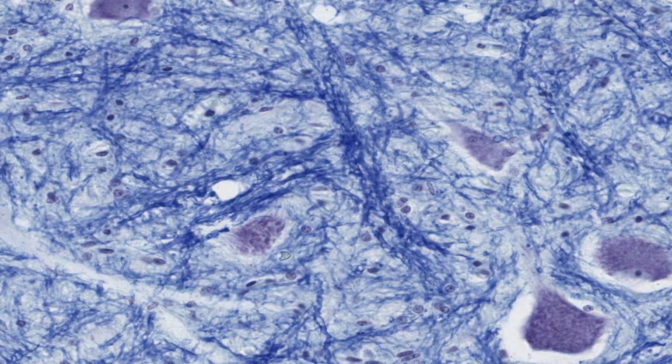It's usually better to examine the glia in white matter, so you can be sure that you're not confusing small neurons with glia. But the myelin stain is a bit too intense in this section, so I've moved to the grey matter in the ventral horn to identify each of the glial cells, as these large ventral neurons are very obvious, and so there should not be any confusion.